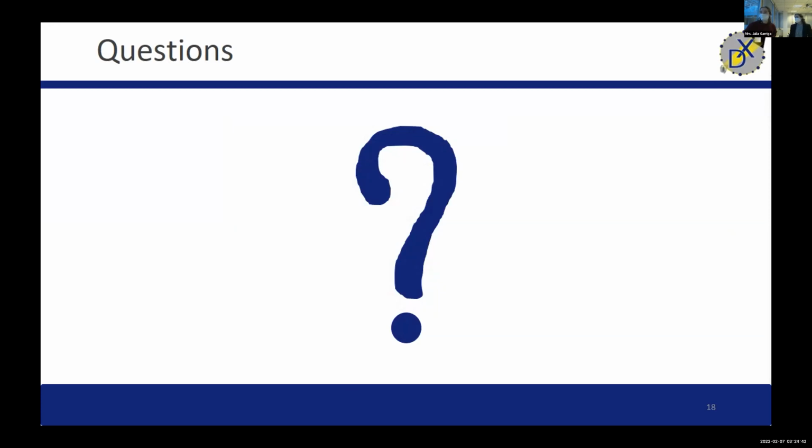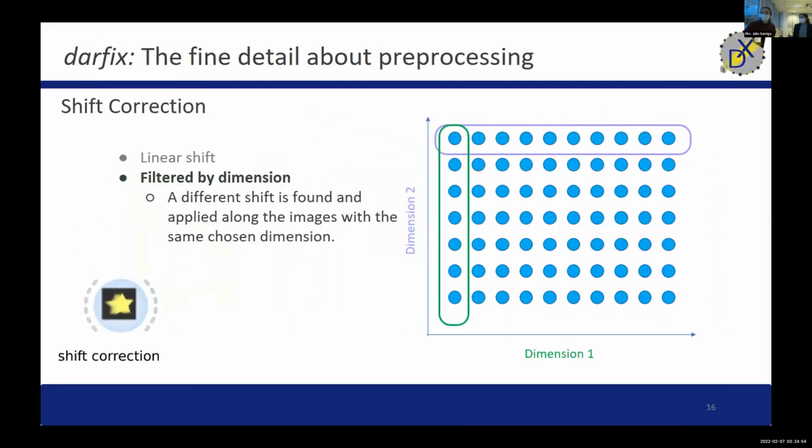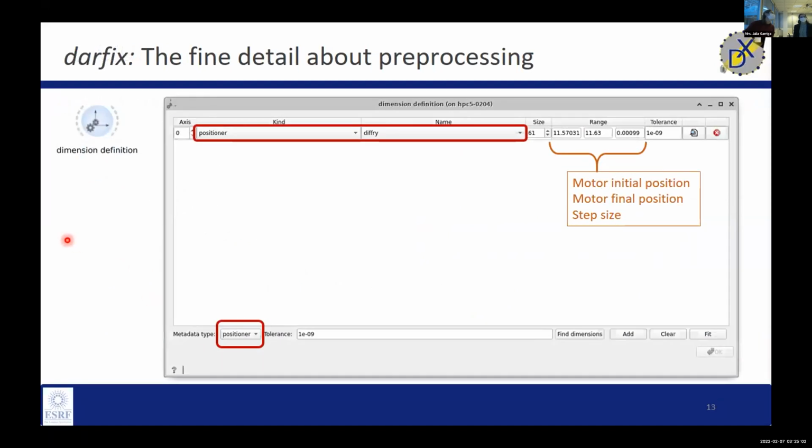Actually it's the note about the dimension definition widget appearing in ESRF widgets instead of in the normal widgets box, in the Darfix widget box. It's a bug that is going to be fixed. In the latest release, the dimension definition migrated to a second folder. There's a new release that I did on Friday that we will update later, and this particular widget will be removed from that folder. So we'll be teaching you how to update Darfix. Congratulations.